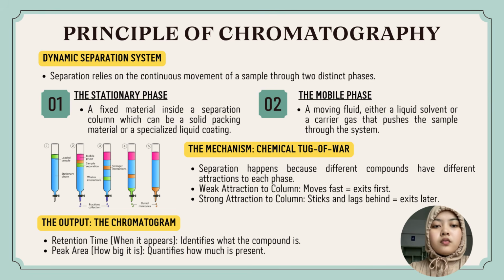The chemical tug of war. Separation is a tug of war based on attraction. Compounds with a weak attraction to the column move fast and exit first. Compounds with a strong attraction stick and lag behind, exiting later.